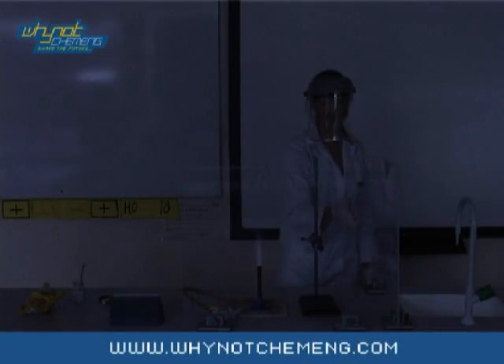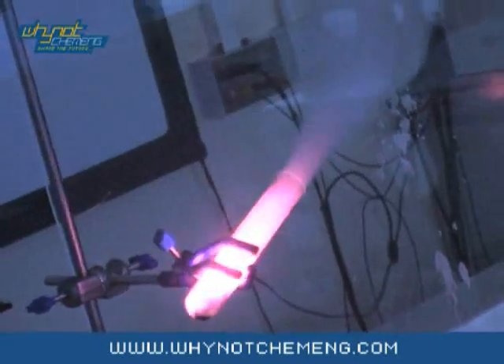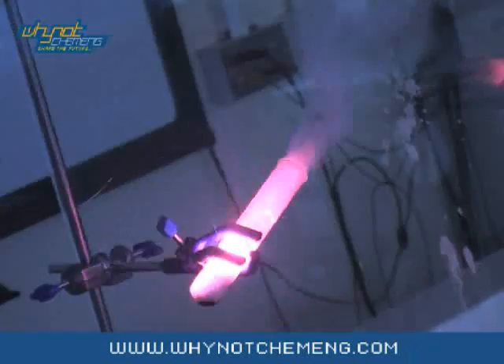The demonstration will produce a lot of smoke, but you do not need to do this in a fume cupboard, because it will damage the fume cupboard. The smoke is only the sugar from the Jelly Baby burning, so it's not toxic. A well-ventilated room is fine.